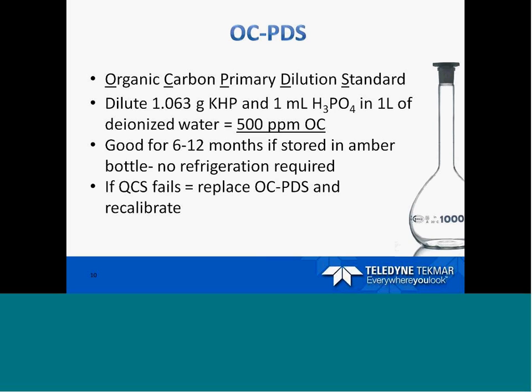As long as that continues to pass, and it also depends on your SOP. Even though it says that as long as your QCS is passing, the calibration is fine, each individual laboratory may have their own standard operating procedure that says, nope, we must calibrate once a month and run these particular standards. Or it may be a municipality that says we have to run compliance samples once a month, and every time that we run that compliance sample, we have to calibrate. So it really depends on your SOP as well.